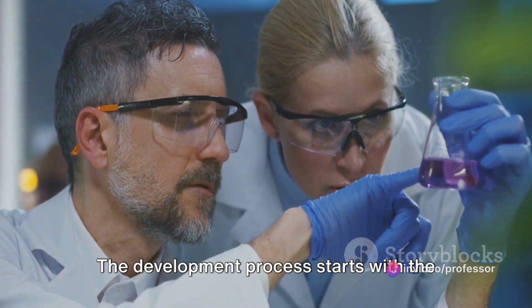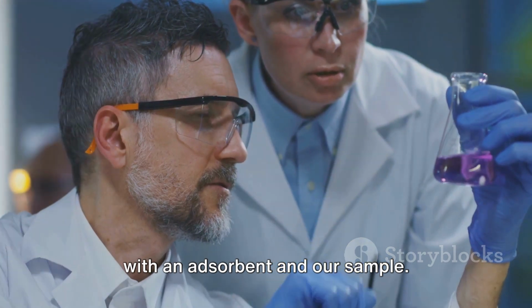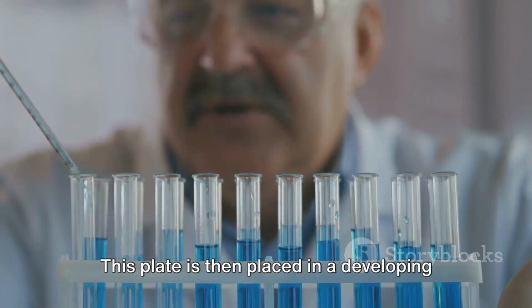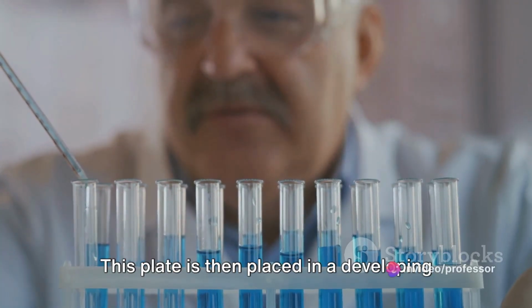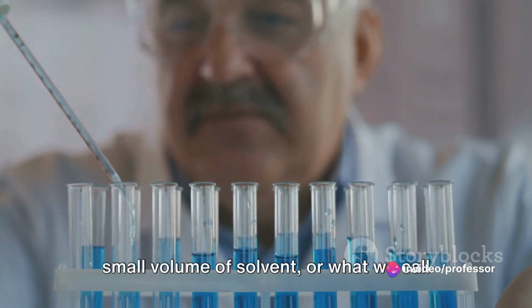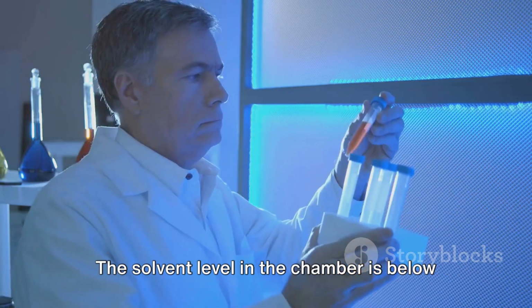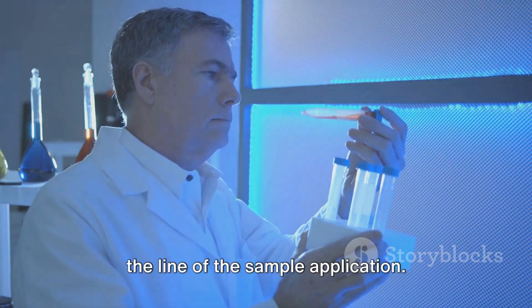The development process starts with the TLC plate, which we previously prepared with an adsorbent and our sample. This plate is then placed in a developing chamber, a sealed environment containing a small volume of solvent, or what we call the developing solvent. The solvent level in the chamber is below the line of the sample application.